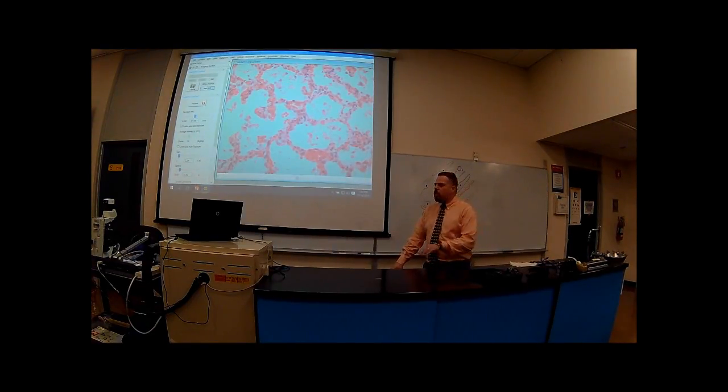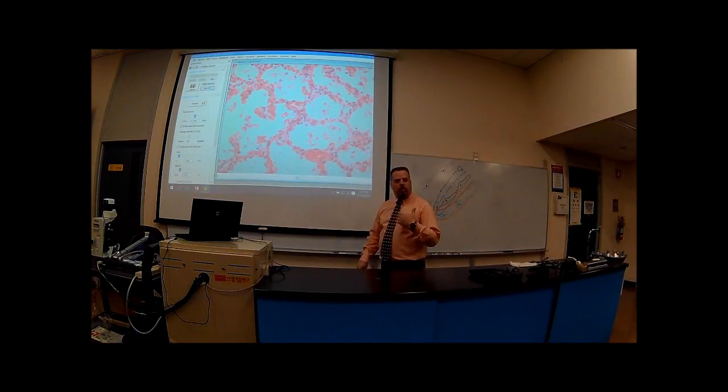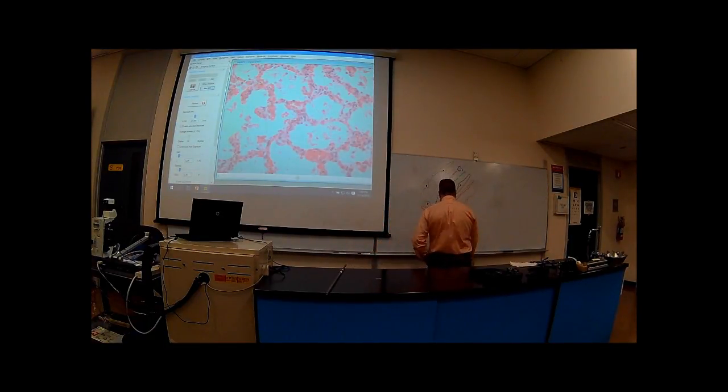Yeah, pneumonia. Now your slides have bacterial pneumonia or viral pneumonia. Just call it pneumonia and call it a day, okay? But this is pneumonia. You've learned about inflammatory processes, the thickening that goes on, and that's what's happening. So why is this bad? All right, let's go back to this picture over here. Okay? What's happening here is that these cells are inflamed. They're enlarged. So no more were they thin like before, but now they're much thicker. And that's going to create more of an issue with many different reasons, but one of them is that it's going to fill or make the lumen of the alveoli much smaller, condensed.